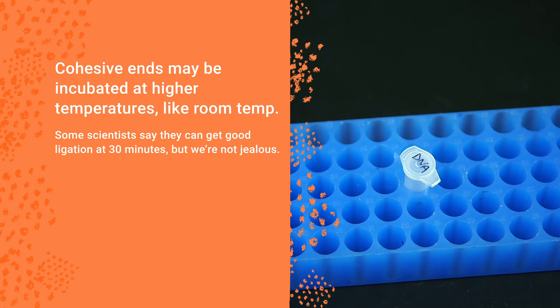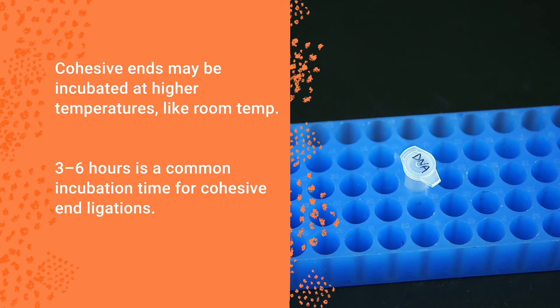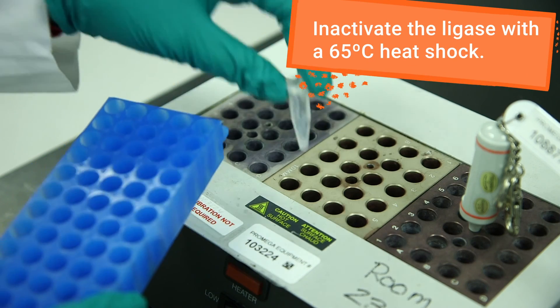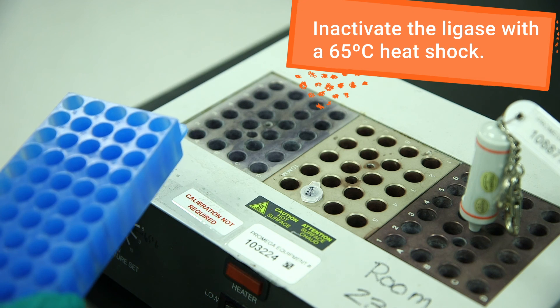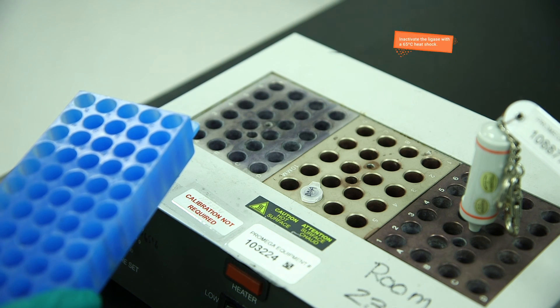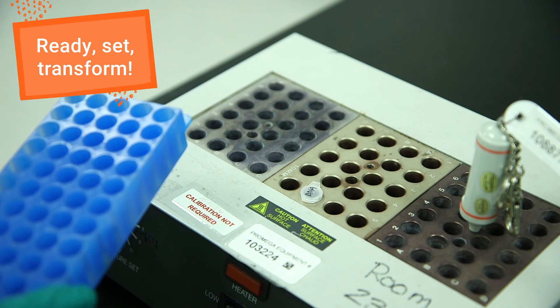Some experienced scientists find that they can get a sufficient ligation of cohesive ends from only 30 minutes of incubation, but 3 to 6 hours is more common. After incubation, inactivate your ligase with a 10-minute heat shock at 65 degrees Celsius. You're now ready to transform your competent cells with the ligation product.